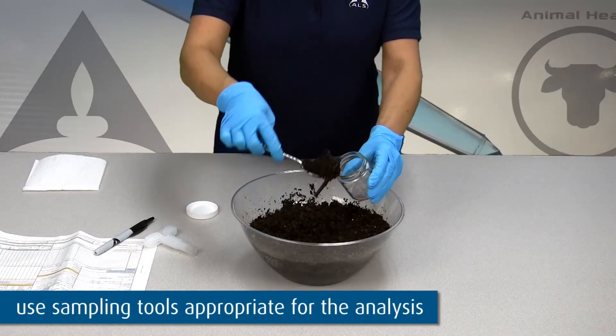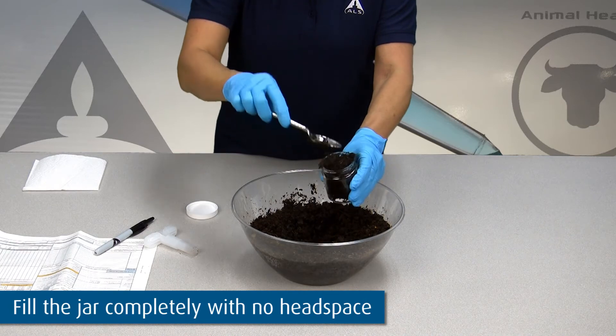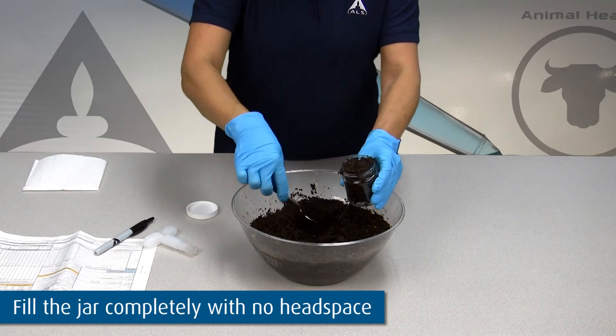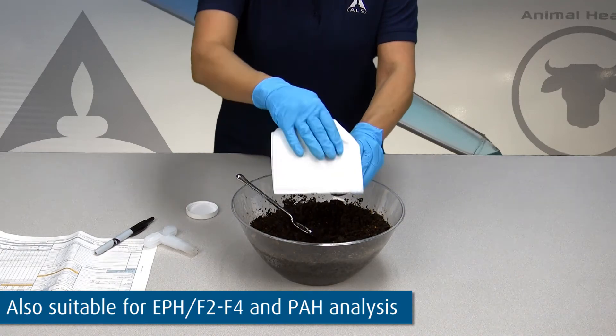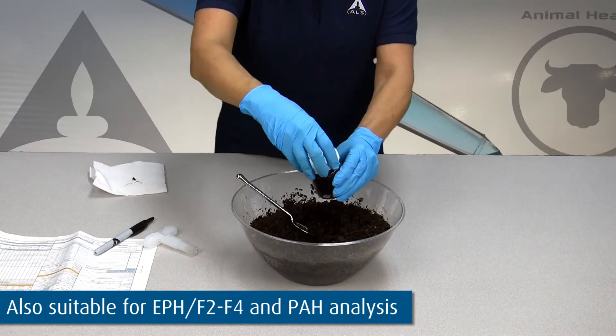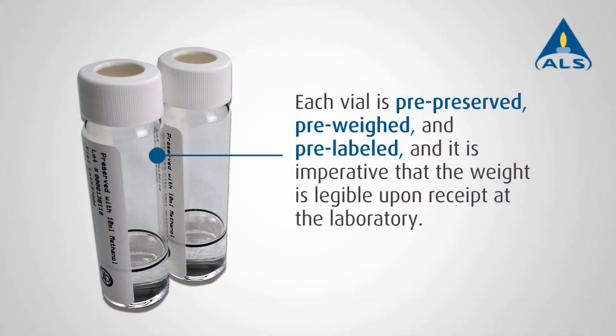Finally, collect a sample for the 125 milliliter jar using the bulk soil collection technique to submit for moisture analysis. This sample will also be suitable for EPH, F2, F4, and PAH analysis. Each vial is pre-preserved, pre-weighed, and pre-labeled, and it is imperative that the weight is legible upon receipt at the laboratory.